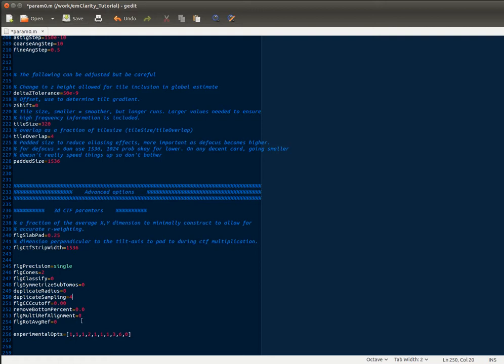The multi-reference alignment is something we're not going to cover now, but if you wanted to turn that on, you'd do that here. And of course, you need to use classification in order to make that happen. And this parameter is also related to the multi-reference alignment.